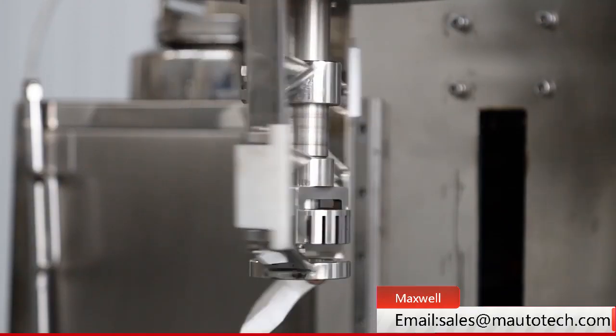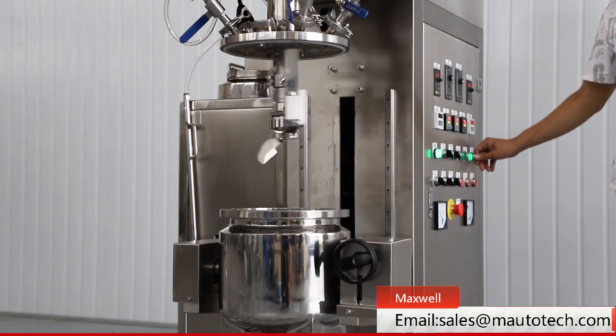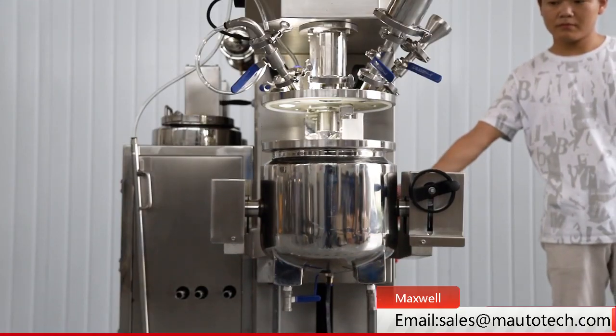The main pot includes a homogenizer with high speed and double direction low speed frame mixer, as well as heating and vacuum function. The oil phase and water phase pot also have mixing function and heating function.